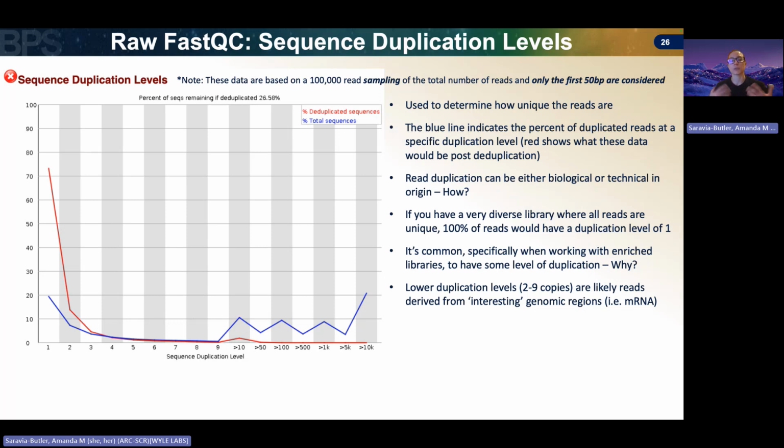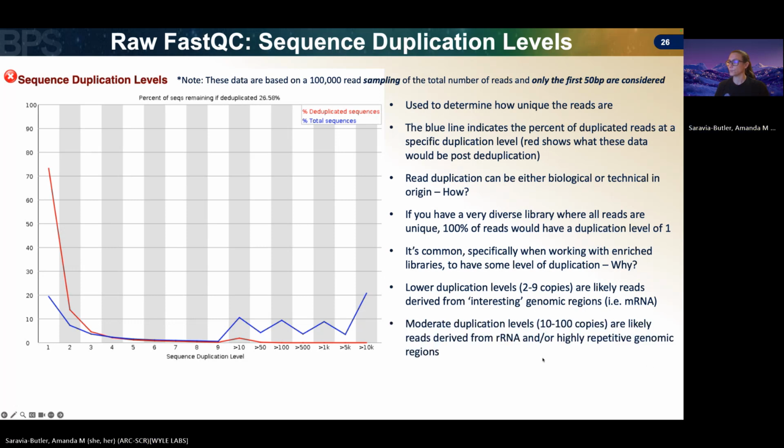So again, this is if you have multiple copies of one transcript in your original sample, and then when you do your chopping, it chops multiple copies in the same place. You'll have the same sequence again from biology.